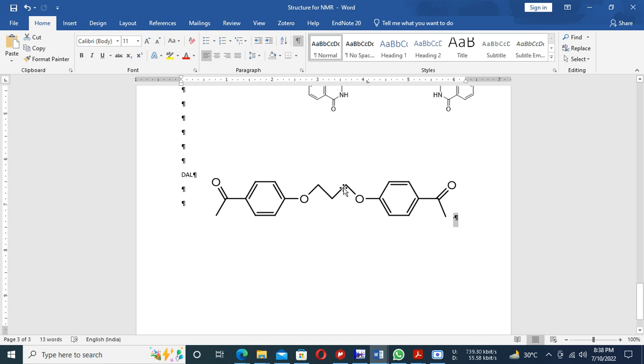There is an aliphatic chain of carbon atoms, a propyl chain, and there is an aldehyde here. Okay, so it's a dialdehyde system. First of all, we can expect an aldehydic peak at around 9.8 or 10 ppm. Now, since there are two aldehydic groups, the aldehydic peak is expected to be intense.